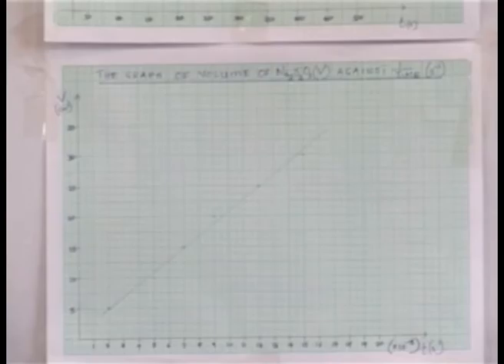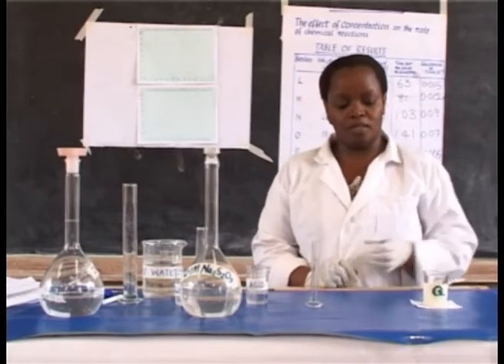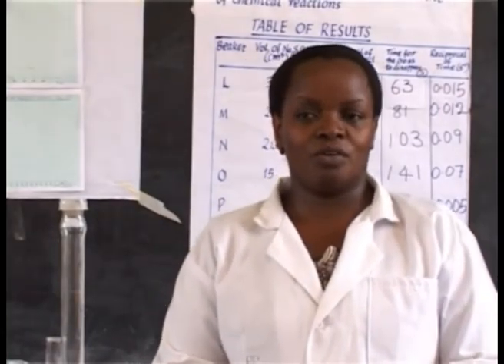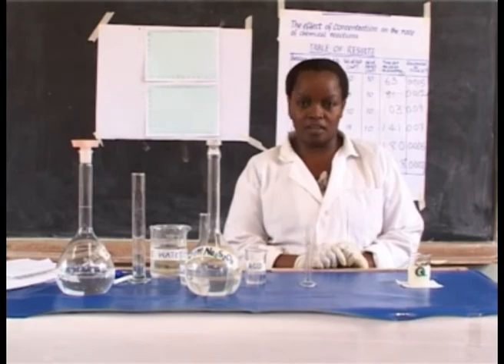After the reactants are mixed, there is a time interval, and the precipitate of sulfur appears sharply. The time required for sulfur to appear is taken as a measure of the rate of the reaction. The rate of a chemical reaction increases by increasing the concentration of the reactants.